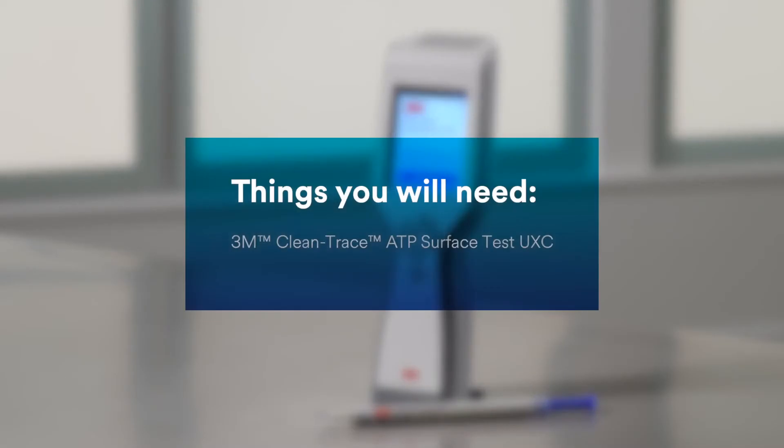You will need a 3M CleanTrace ATP Surface Test UXC and the 3M CleanTrace Luminometer LX25.